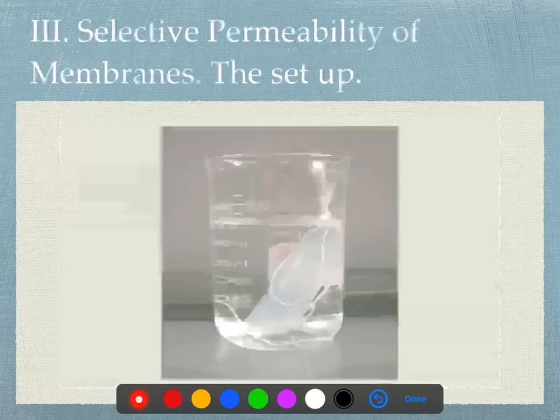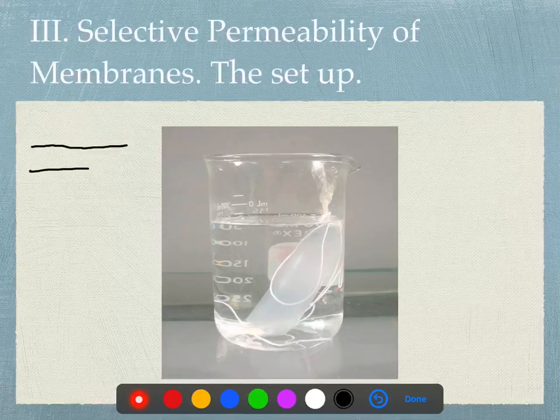All right, let's go on to the third exercise. This one explores just how selective dialysis tubing is. So let's talk more about this tubing. What is it made out of?